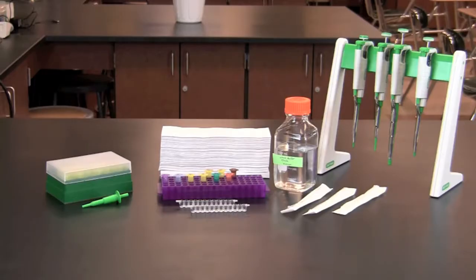In this video you will learn how to perform a Quantitative Enzyme-Linked Immunosorbent Assay or ELISA. The ELISA uses antibodies to detect an antigen or antibody of interest by exploiting the tendency of proteins to adsorb or stick to a plastic microplate. In this activity, an ELISA will be used to measure the amount of an antigen present in a sample.